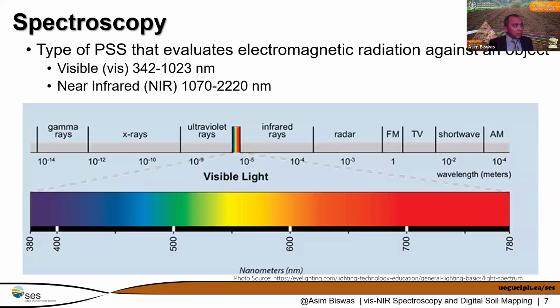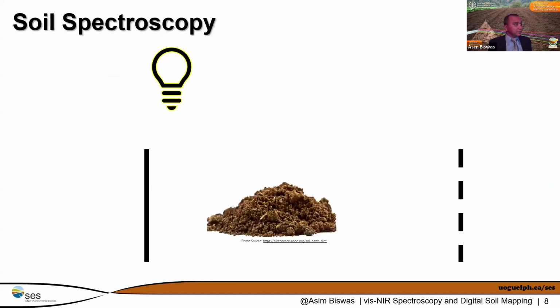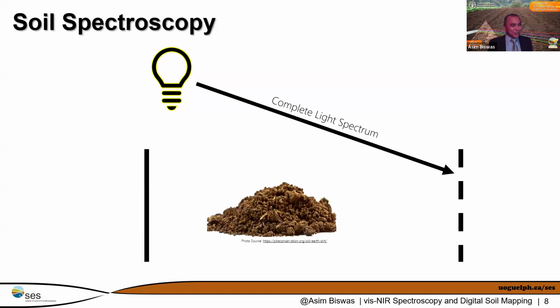The same way within that visible range, if we shoot that light onto soil, what will happen? And the same way, if we look at the near infrared range beyond our visible range, which human eyes cannot actually detect, some of the sensors could actually detect those changes. Now, can we take that spectroscopy to the soil and the GLOSOLAN spec? I know we're talking about what happened very briefly before I go forward.